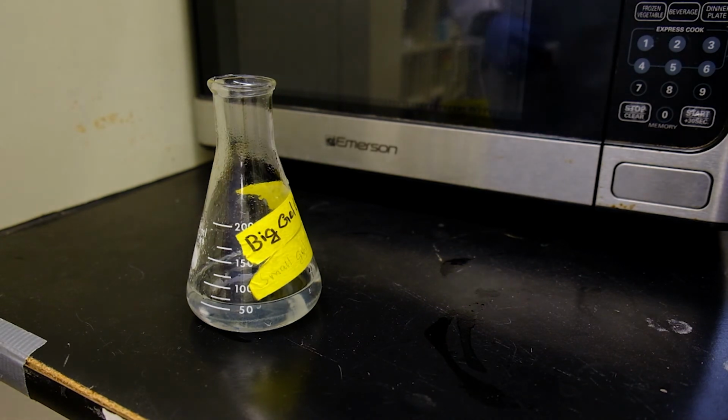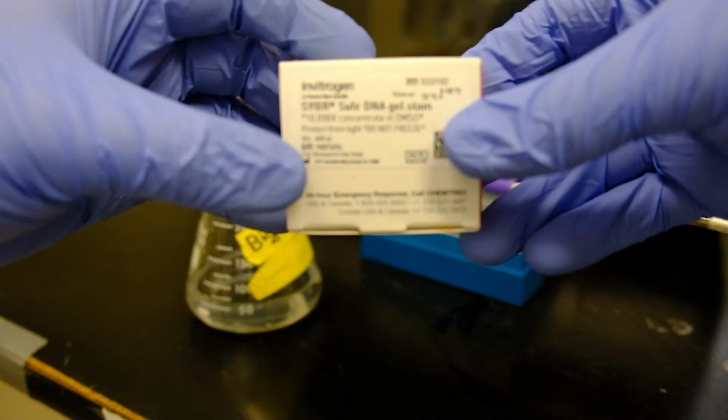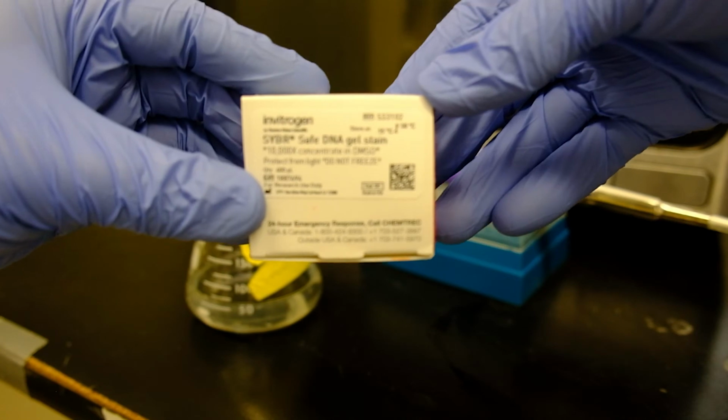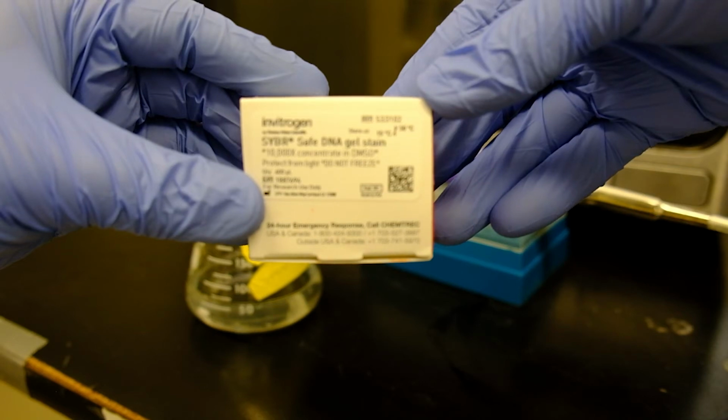Get a pipette and the matching tips, and prepare your dye. This dye is extremely carcinogenic, so wear gloves and don't let it get on your skin. It's also photosensitive, so try to minimize the time it spends outside of the box.